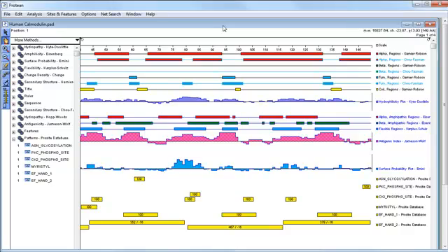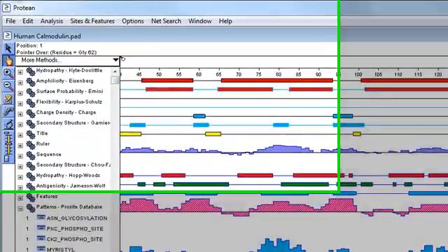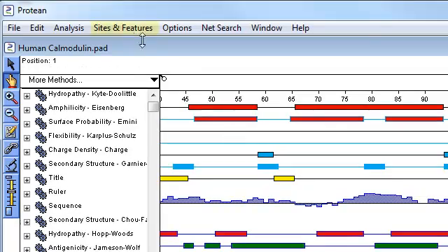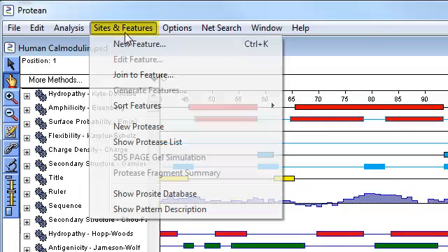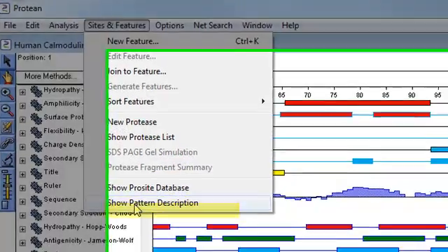To view the Prosite database entry for a specific pattern, first select the pattern, and then select Sites and Features, Show Pattern Description.